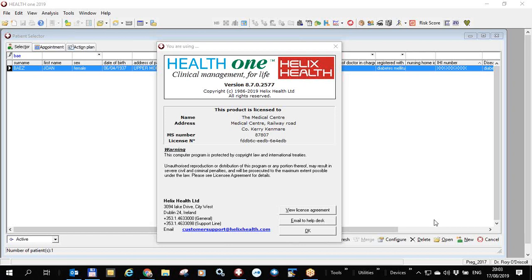Today is Saturday, the 17th of August 2019. This is one of a series of videos on the latest release of Health One, version 8.7. The version I'm demonstrating this evening is 8.7.0.2577.